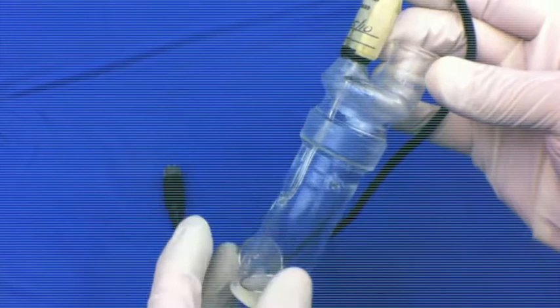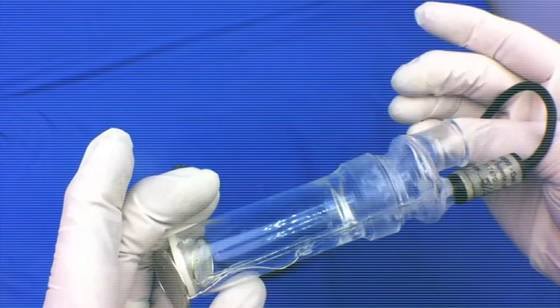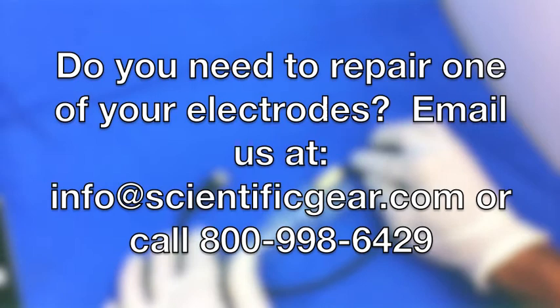The small white wafer, also referred to as a frit, forms a seal on the bottom of the electrode just above the platinum screen. By sealing the bottom of the electrode, a second reagent referred to as cathelite can be introduced and maintained inside the electrode.